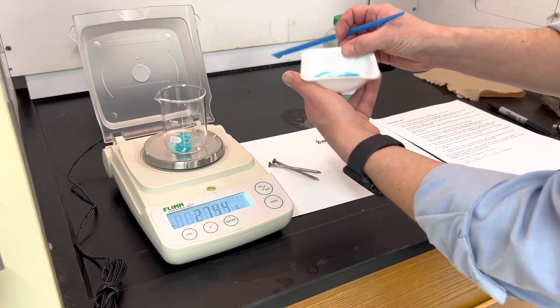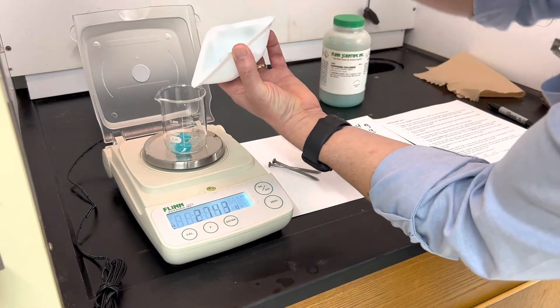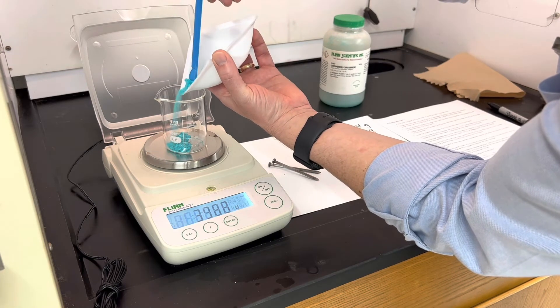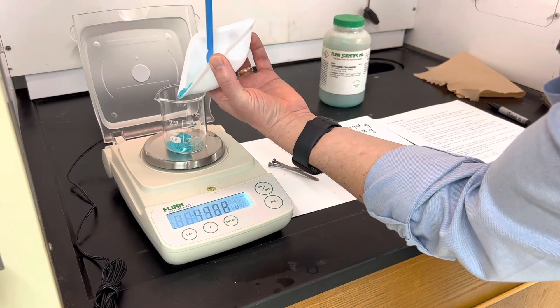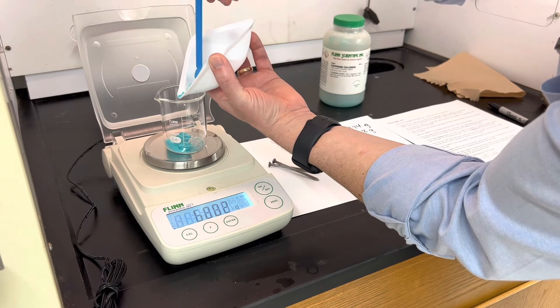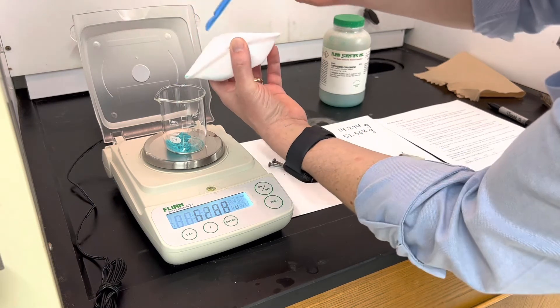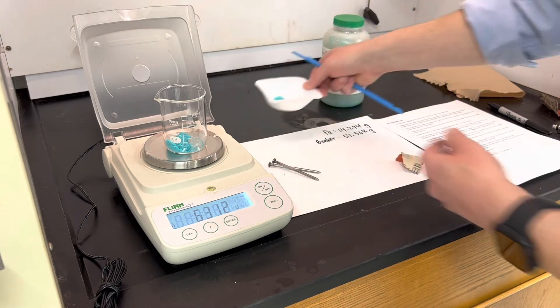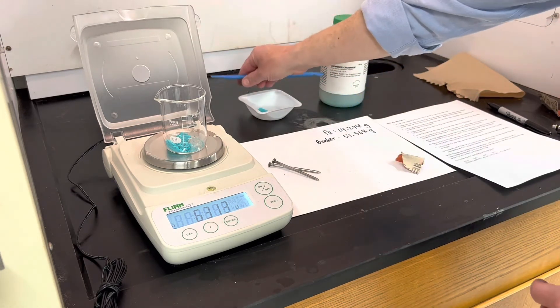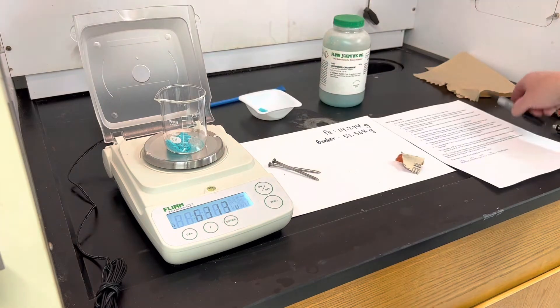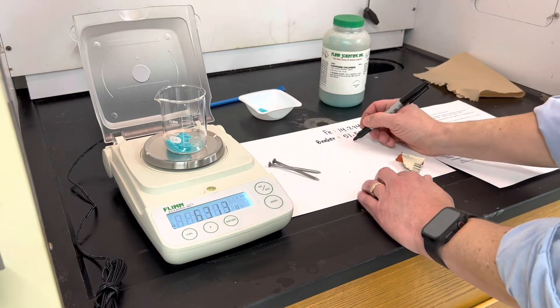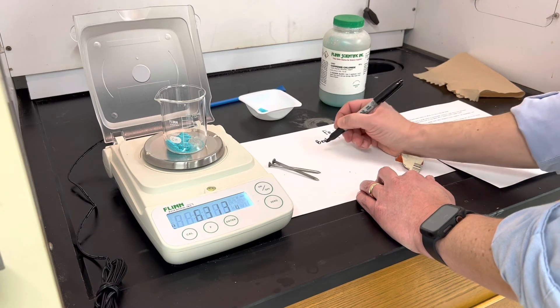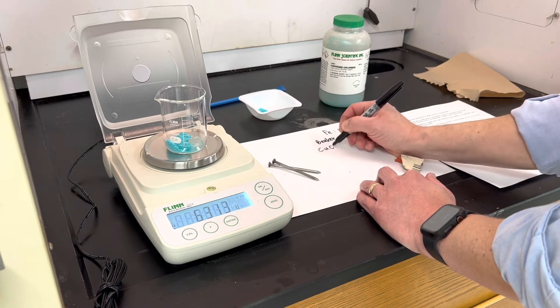Another way I can add this if it's in a weighing dish already is just use the dish to transfer. And I'm over 6 grams, so I'm going to go ahead and use that value: 6.313 grams. That is my copper chloride.